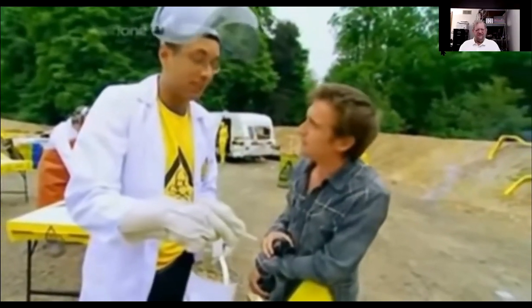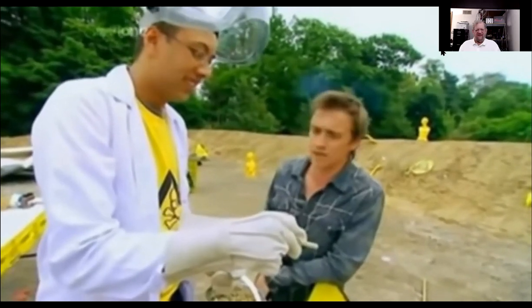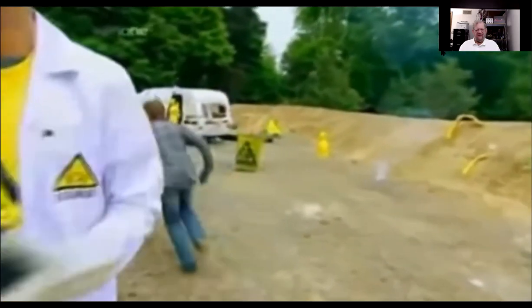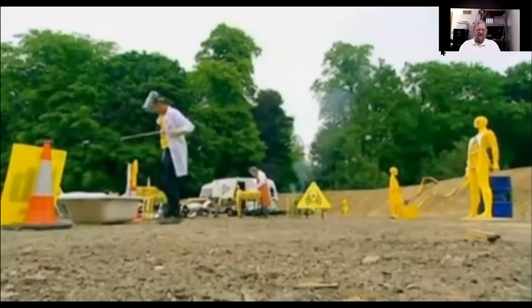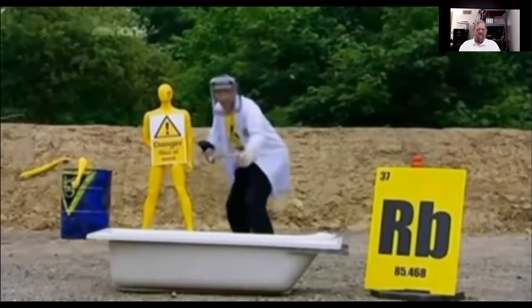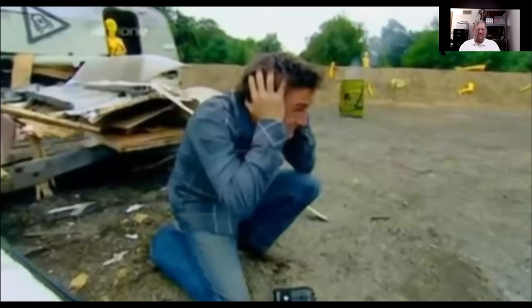Well, it might not look like much, Richard, but it's a highly reactive metal. It's sealed in this glass tube under argon atmosphere conditions, just for safety. Right, so what's going to happen when you drop that in the water? Well, imagine, if you will, letting off a hand grenade in a bathtub. Righto, I'm off. Have that. Okay, good luck. Okay, Tickle. Drop the rubidium in the water. Everybody, 2 grams of rubidium will only react when our specially designed vial dissolves in the water, which gives John a few crucial seconds to get into our safety zone.